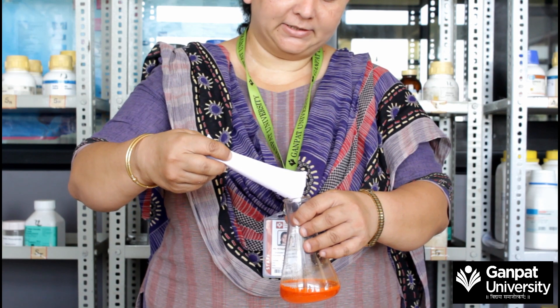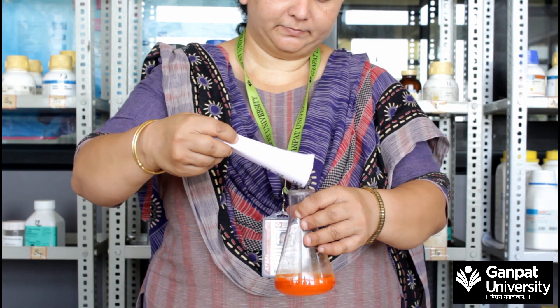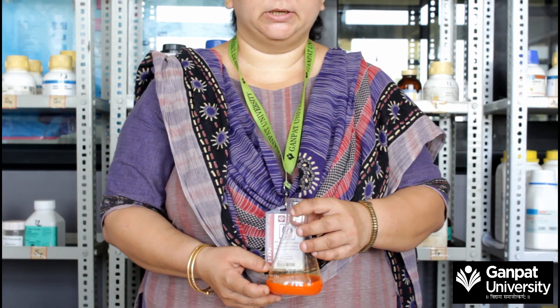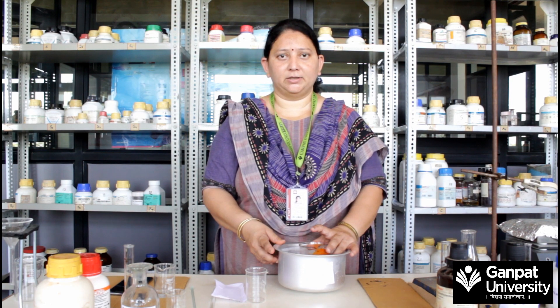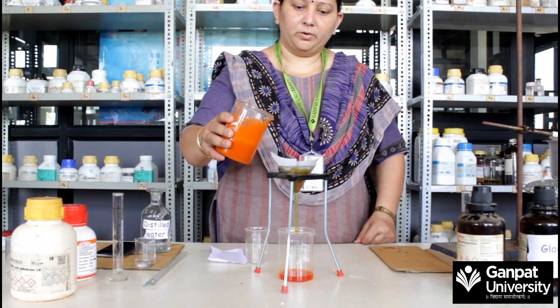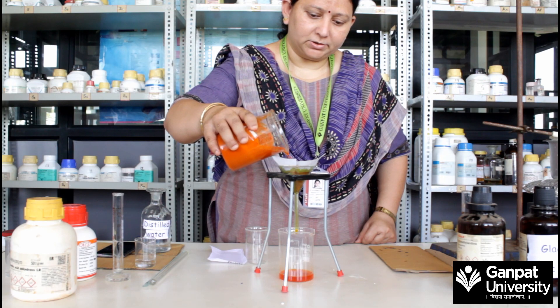Now add 15 grams of sodium chloride and heat this mixture until the solution becomes clear. After heating for 10 to 15 minutes, cool the mixture in an ice bath. Now filter the precipitate of methyl orange.